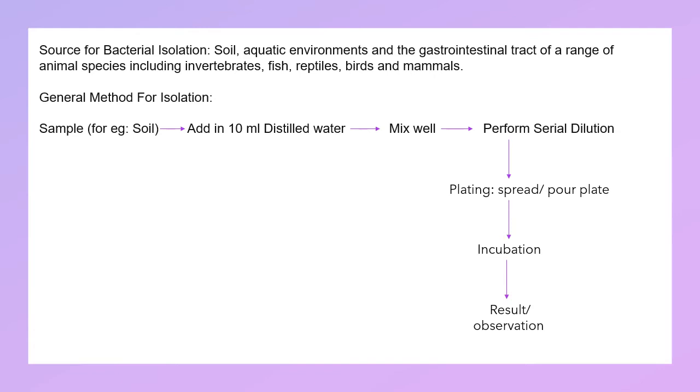Here I may keep on saying bacterial, but it does not mean that only bacteria secrete chitinase enzymes. There are even fungi known which are able to produce chitinase enzymes. So you may even get a fungal isolate.